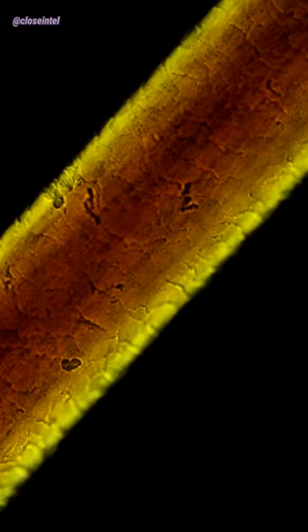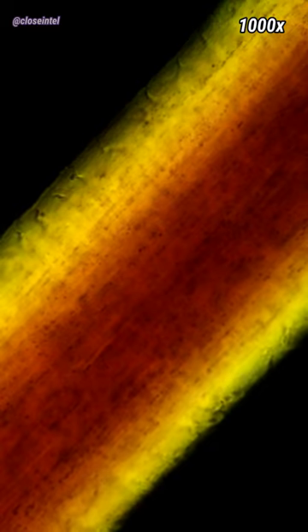I'd always seen the pictures of the scales from electron microscopes and didn't think I'd be able to see them this well with the light microscope, but you can definitely see the structure.